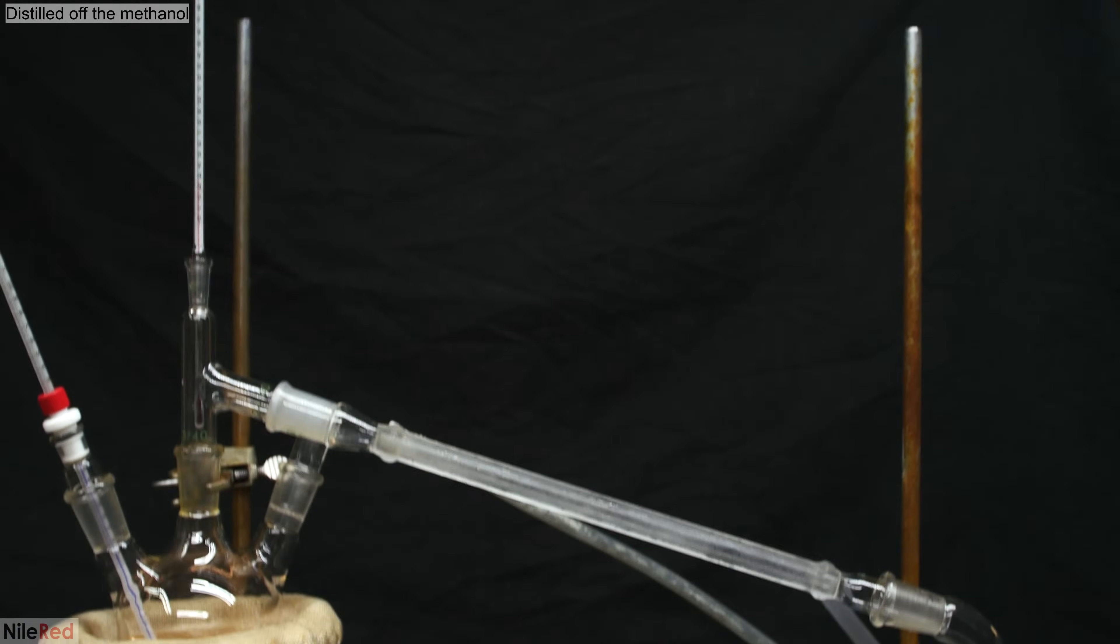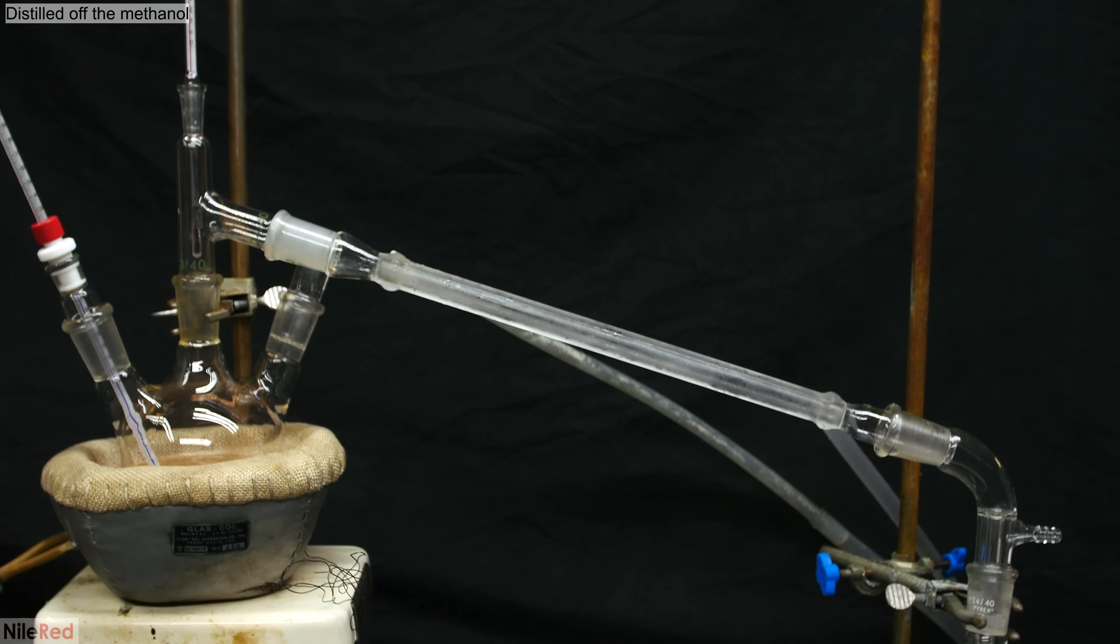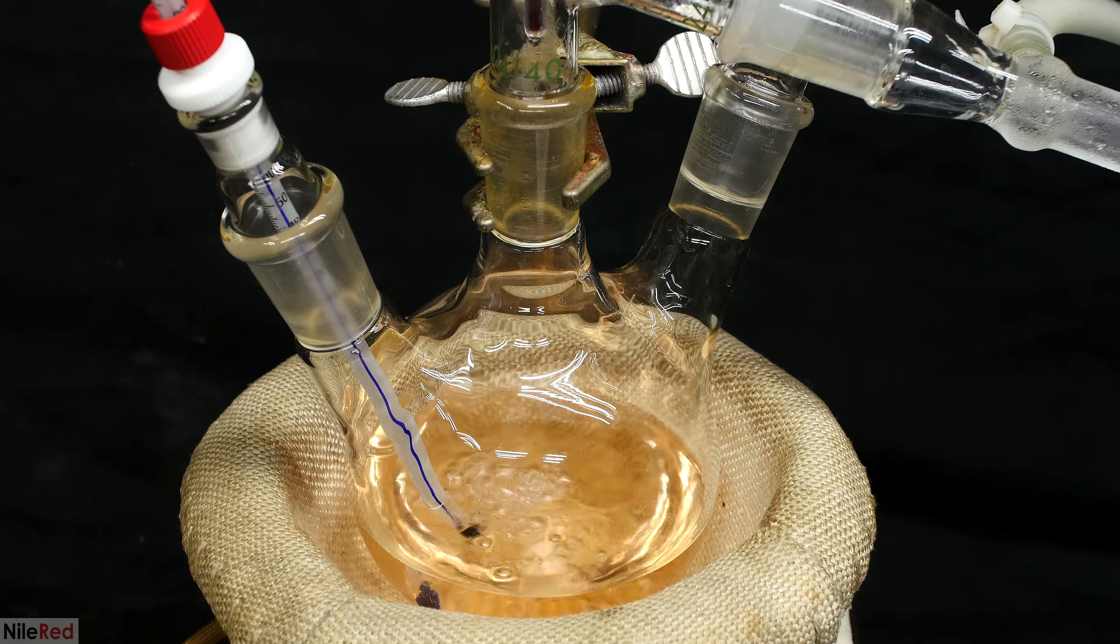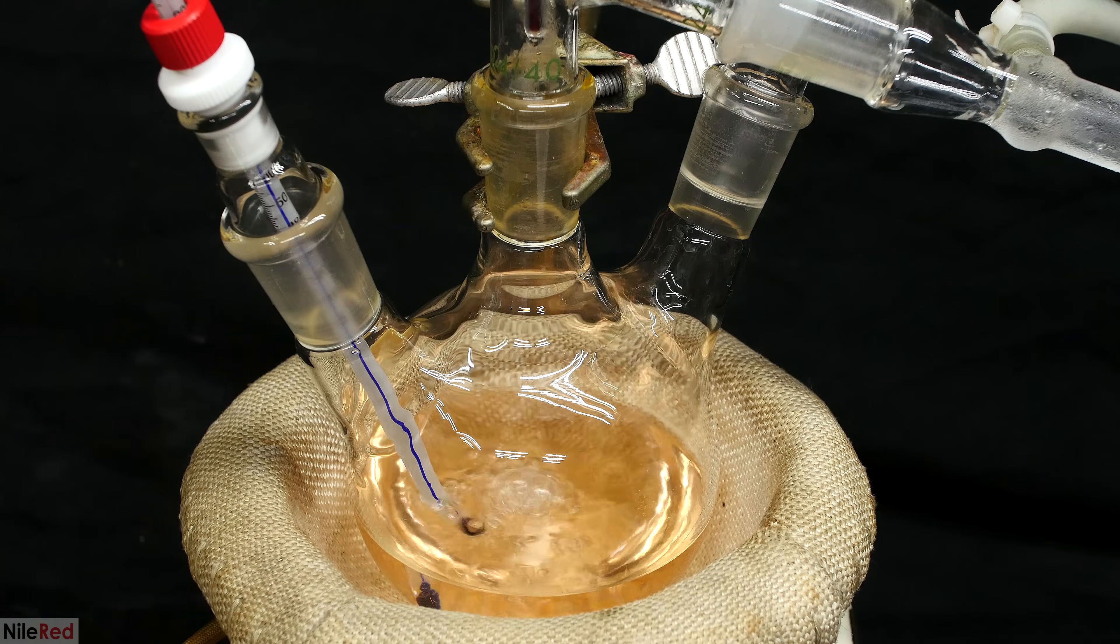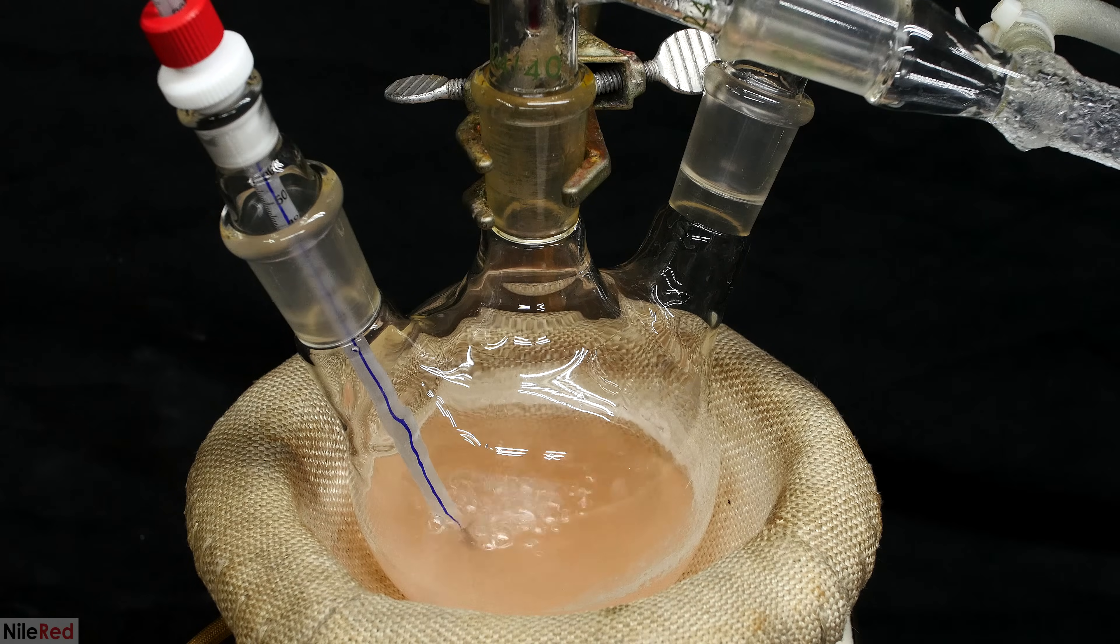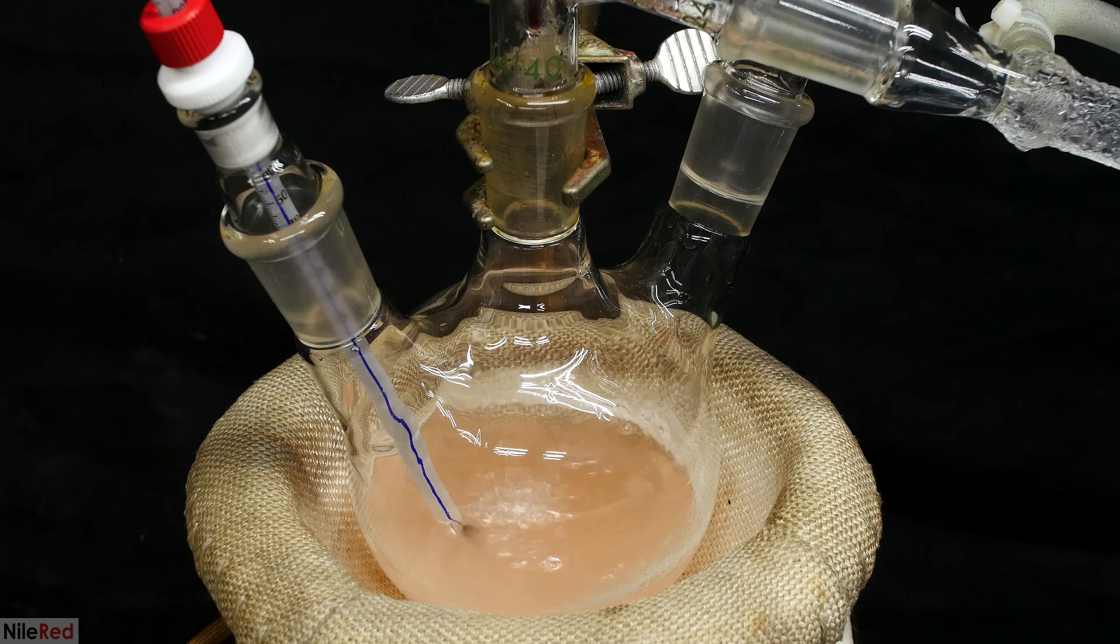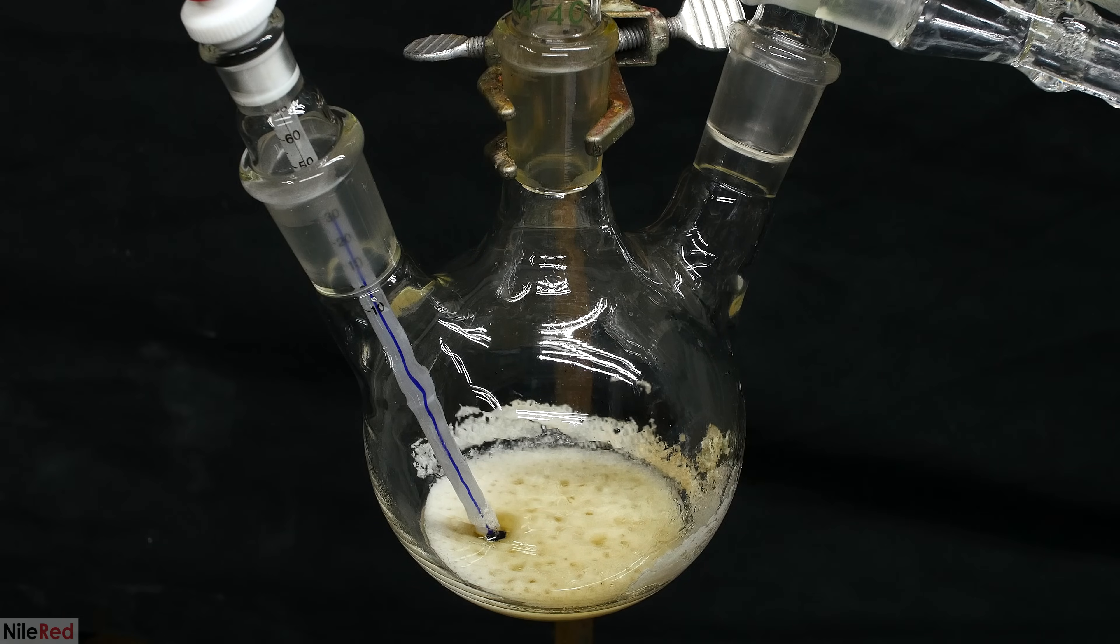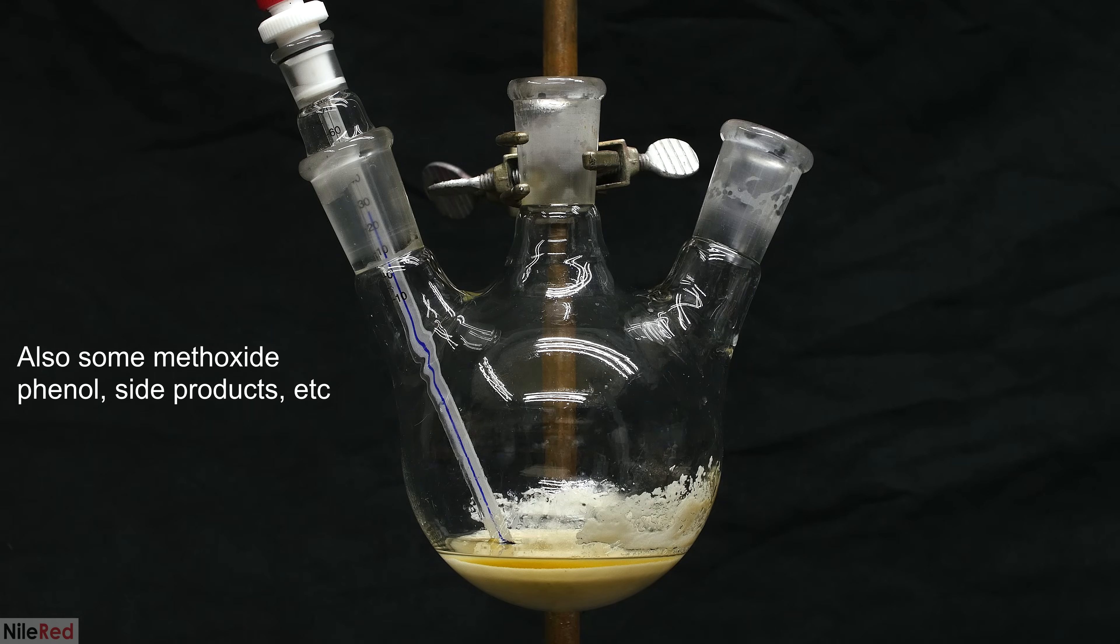Once I hit the hour and a half mark, I then set things up for a simple distillation. Our goal here is to distill off the methanol, and because we're going to be distilling to more or less dryness, it's important not to crank the heat up too much. Eventually, most of the methanol is gone, and we're left with a nice cake at the bottom of the flask. What we have left here is mostly sodium iodide salt, as well as our product anisole.